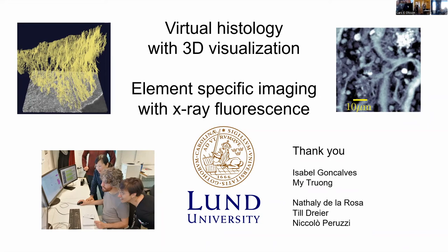Thanks a lot. We have two excellent questions from our online audience. Iran, PhD student from medical faculty, asks, I was wondering about volumetric analysis, if it is really accurate since the processing also causes tissue shrinkage. Is there a method to normalize to that shrinkage?